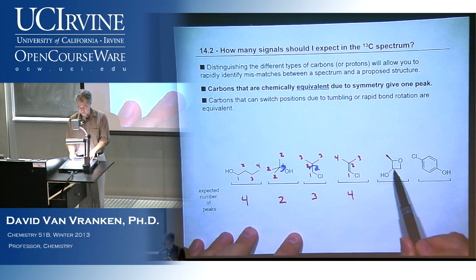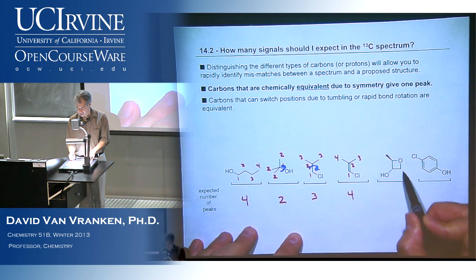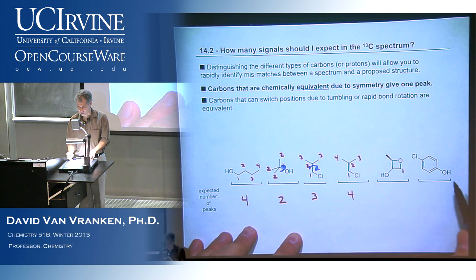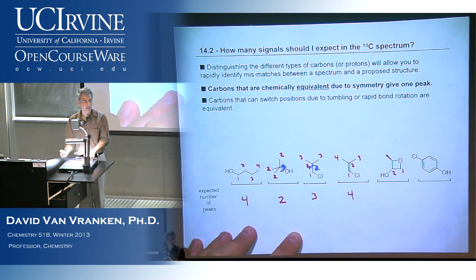Okay, so here's another, and I'm trying to make it look complex and fancy here to throw you off. So here I've got 2 carbons that are attached to the oxygen atom. I'll start labeling that one as 1. Carbon number 1 here has 2 H's attached. There's no other carbon like that in this molecule. Here's carbon number 2 that has a hydroxyl group attached. That's distinctive and unique. There's no other carbon that has a hydroxyl group attached.